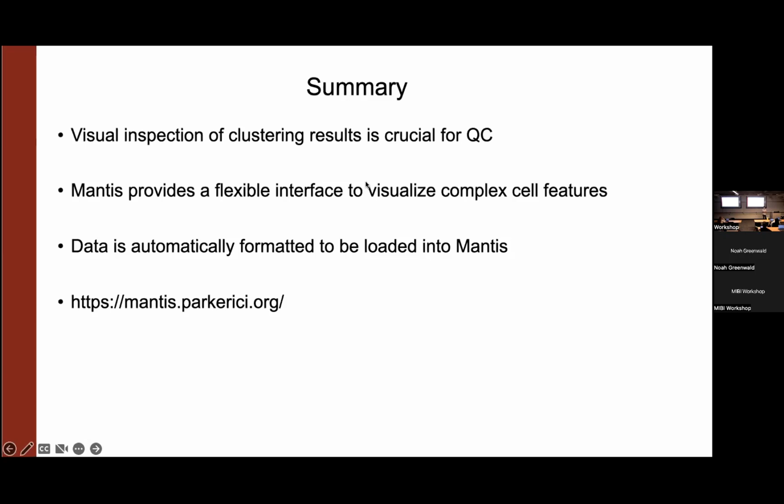It could be with other imaging platforms that maybe it's not so straightforward to do this type of correction. If different days, maybe you're trying to compare different cohorts that were acquired on different instruments. There's all these other issues that could come up where this approach would be complicated. But that's why for things we can control, we really try and control it.